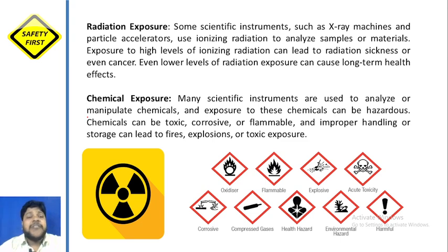There must be a very clear understanding about the hazards, and they must be well communicated to users, as well as following all the guidelines to protect the environment. So we must look for its benefit, but reduce its harmful impact. Many instruments using radiation, like X-ray machines, are very common. Particle accelerators are very common in this area where we are working to analyze materials and know their properties. So the risk imposed by this exposure should be well communicated to the users and anybody who could be impacted by it.